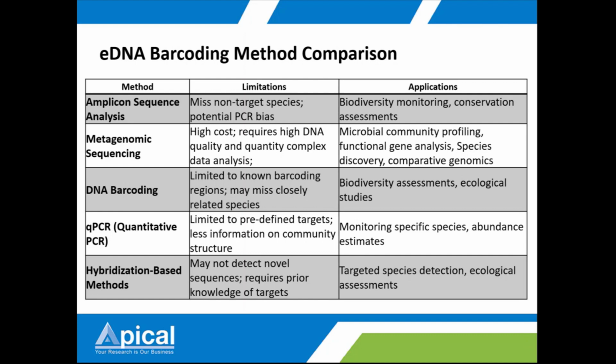For this, metagenomic sequencing is useful if you are looking for microbiome profiling, or you want to look into functional gene analysis, species discovery, or comparative genomics. So this method is useful for these applications, right?